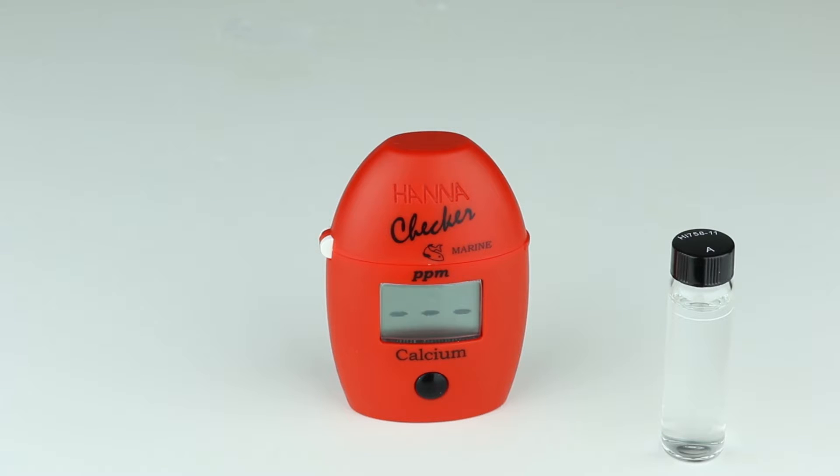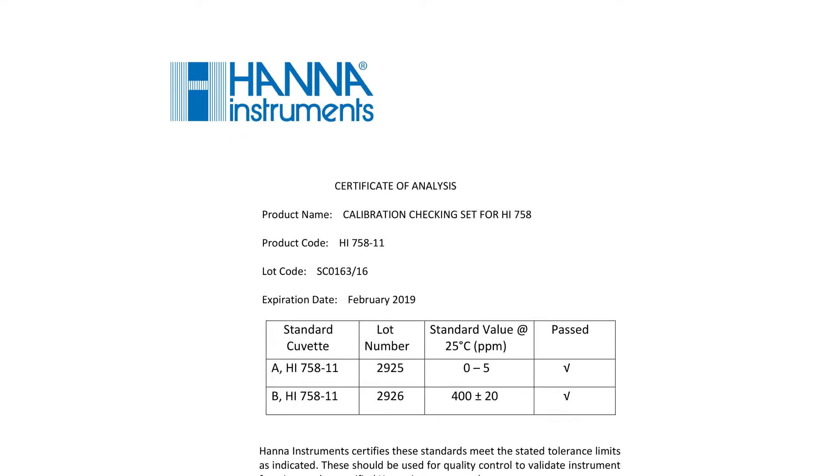Reagent addition is not necessary and the cuvettes can be reused until expired. The meter is considered operational if the result is within plus or minus 6% of the value stated on the included Certificate of Analysis.